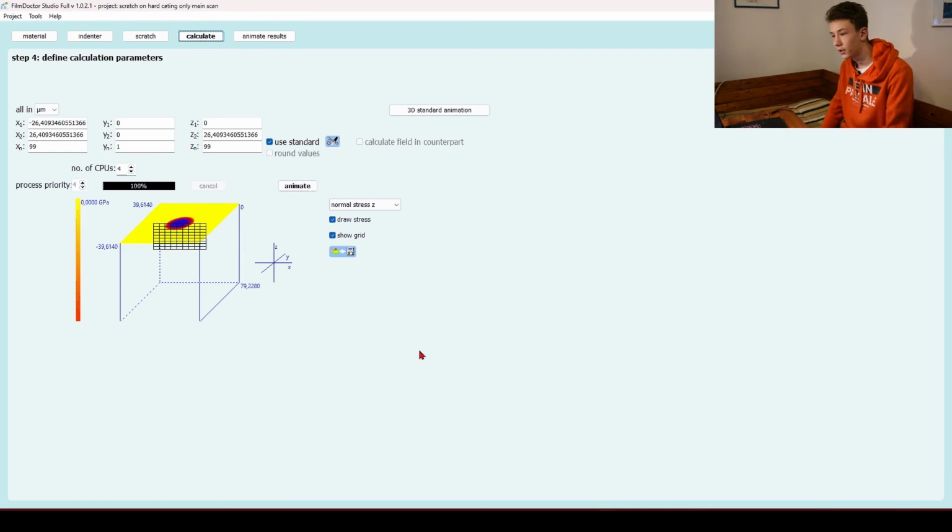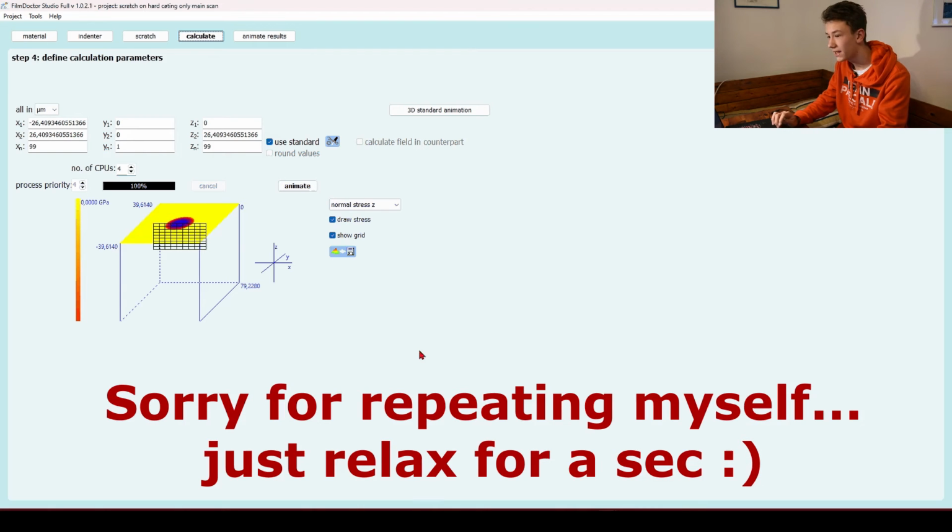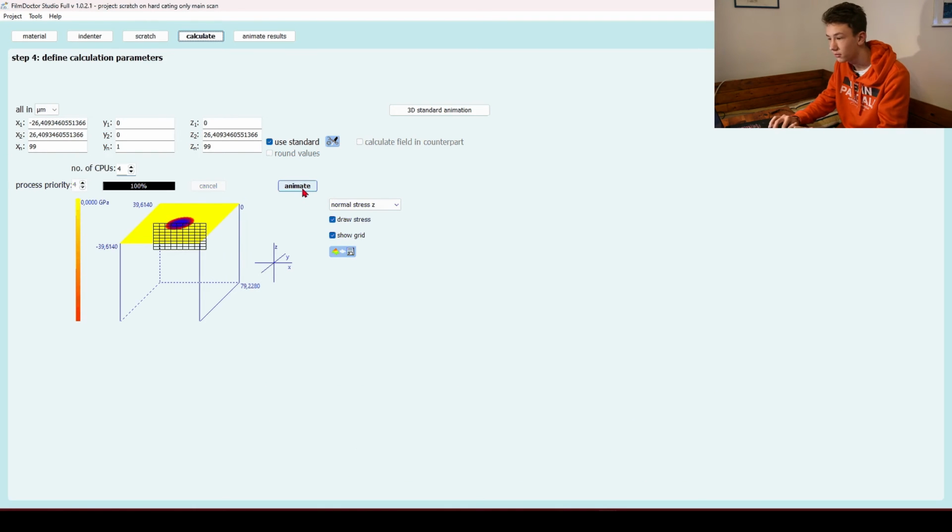Alright, sorry for a little jump cut. I had to go and get something, but yeah, now I'm done and I'm back. So over here on the calculation page, all you want to do is just press on animate. You can decide whether you want to have a 3D animation or a 2D animation. If you simply want a 2D animation, just press over here on the animate button. I already did that for you, and it took me around 5 minutes, so it shouldn't take too long for you too.